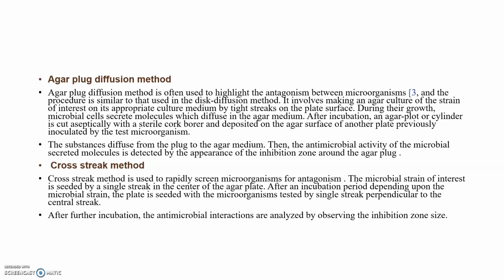Then we incubate. After the incubation period, depending upon the microbial strain, the plate is seeded with the microorganism to be tested by a single streak perpendicular to the central streak. After further incubation, the antimicrobial interactions are analyzed by observing the inhibition zone.